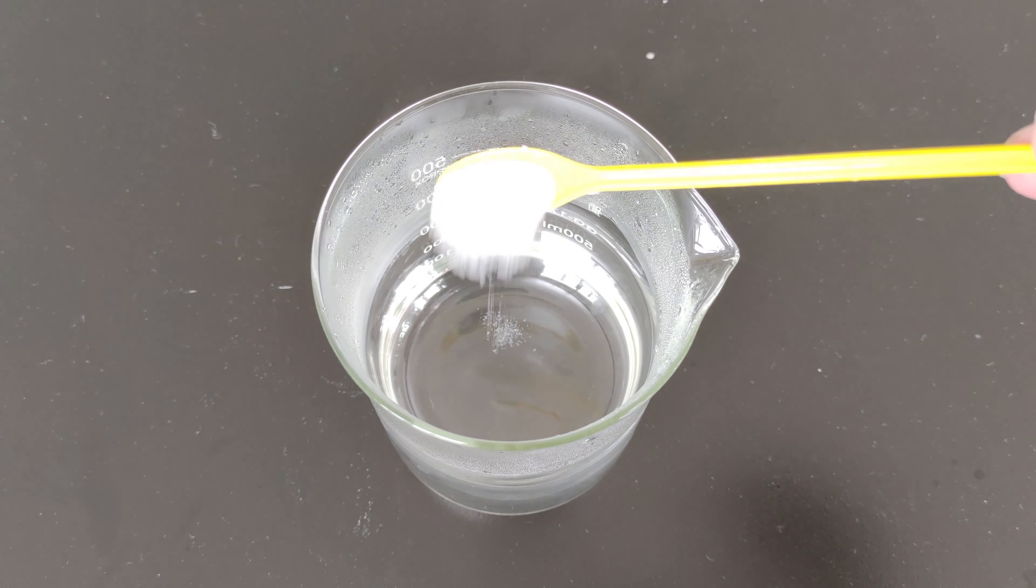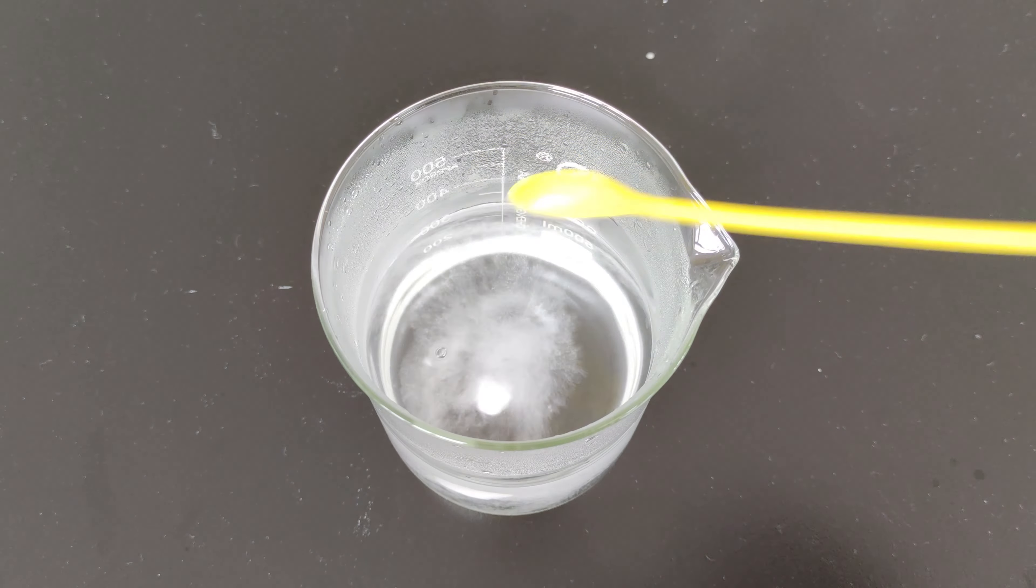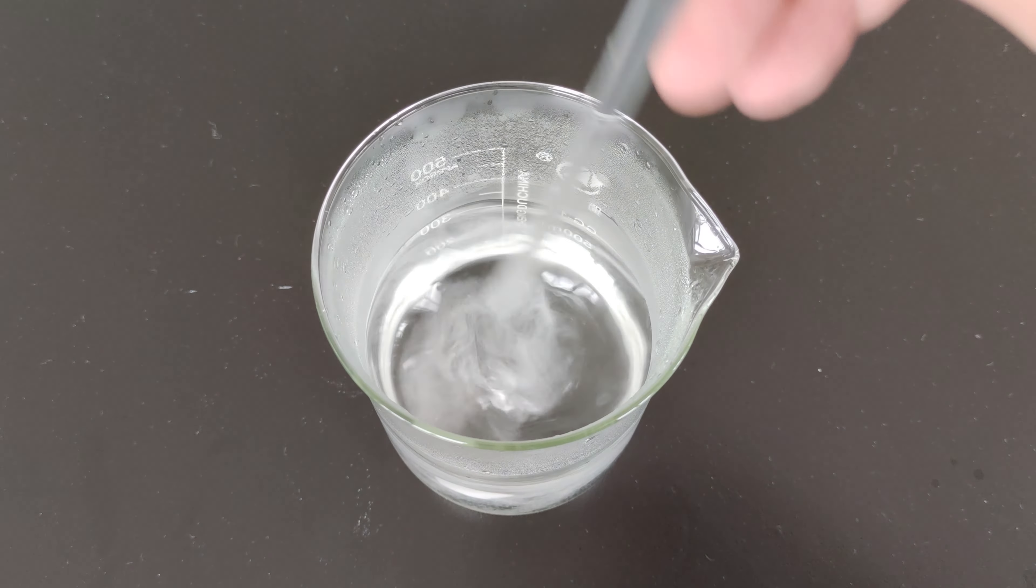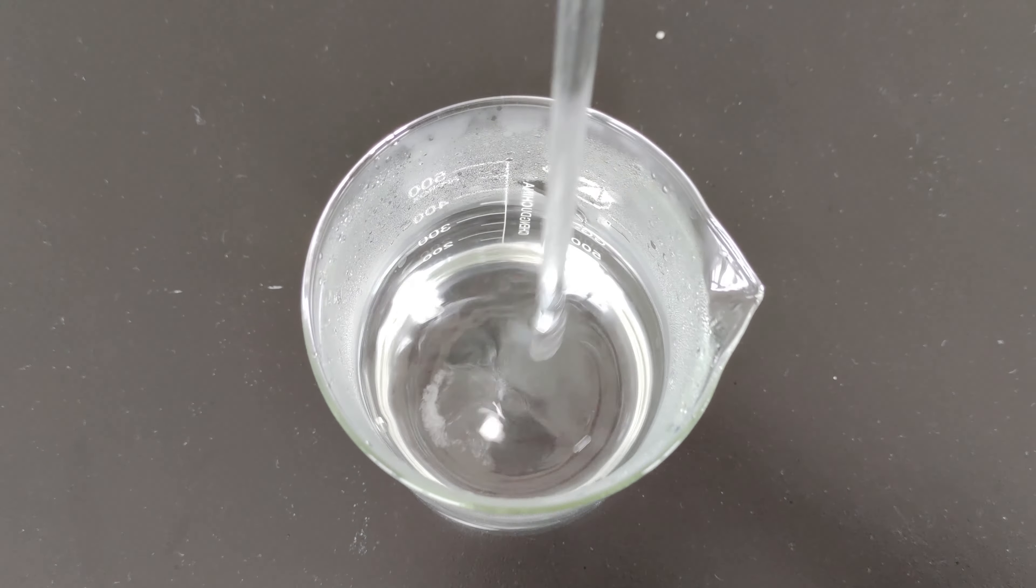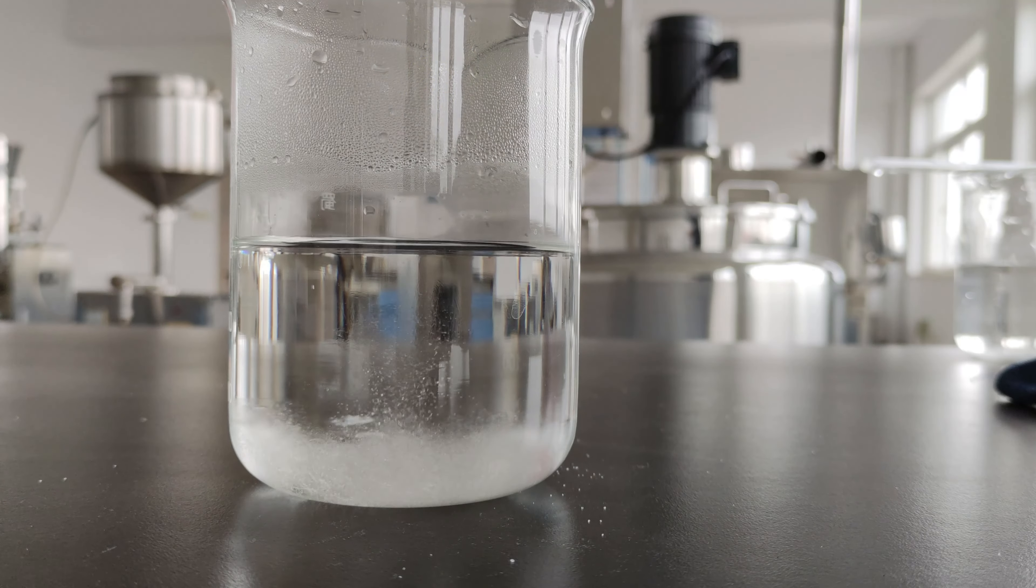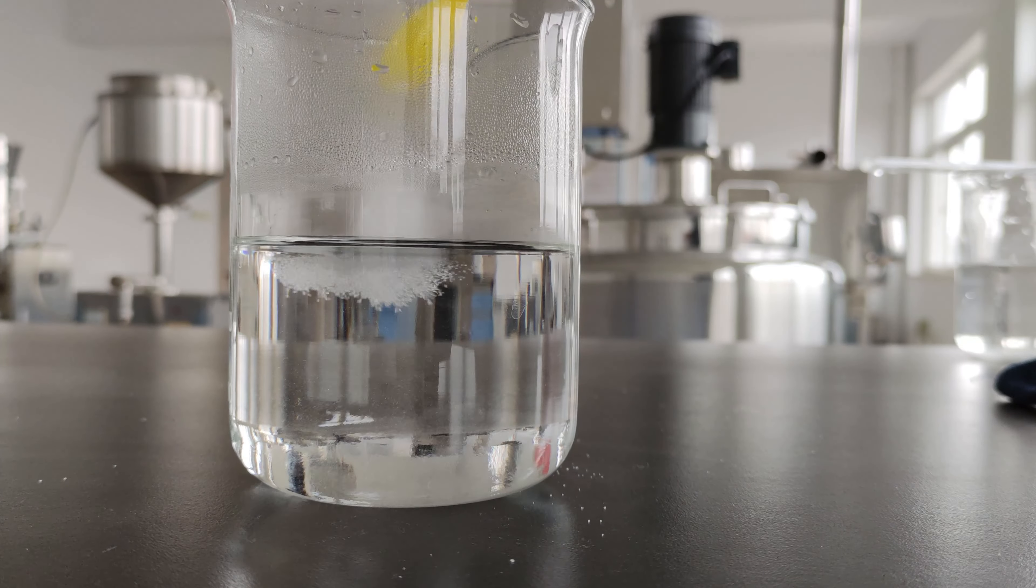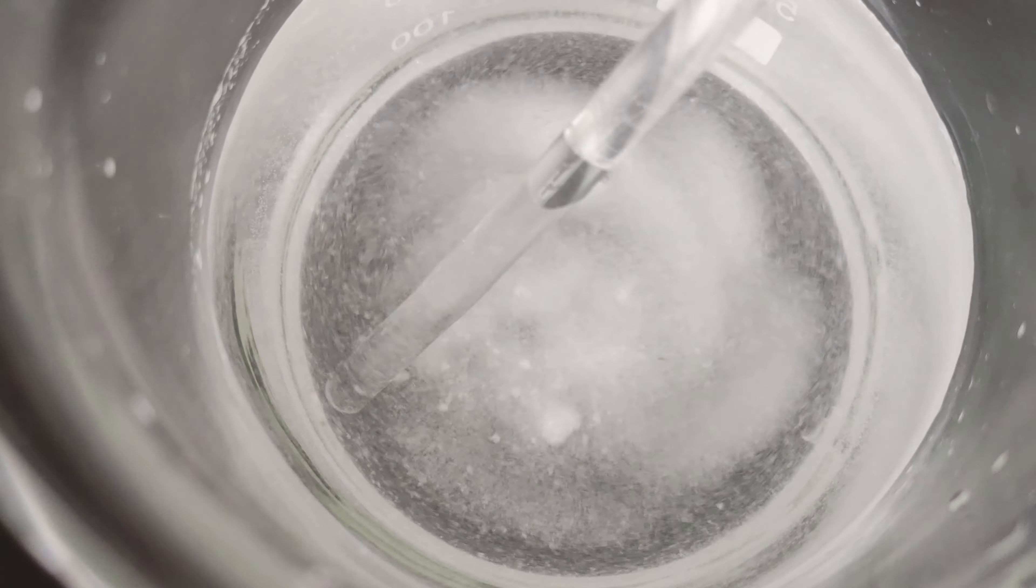Alright, if we want those sodium chloride crystals, step one is getting a saturated sodium chloride solution ready to roll. Add sodium chloride to hot water and stir until it dissolves completely. Repeat this procedure until a small amount of sodium chloride remains undissolved at the bottom of the beaker, indicating that the solution is saturated.